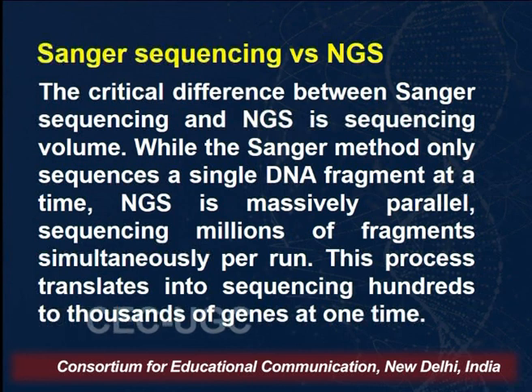Now let's compare Sanger sequencing versus next generation sequencing. What are the similarities to start with? Both use sequencing by synthesis. Both are basically using the terminator sequences.